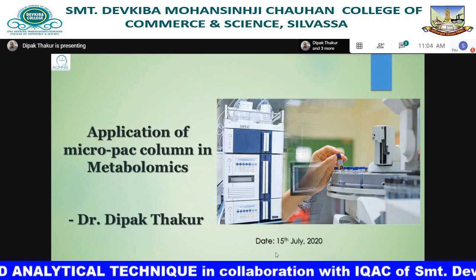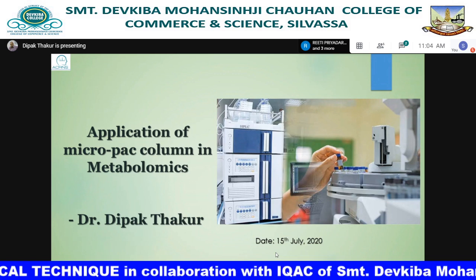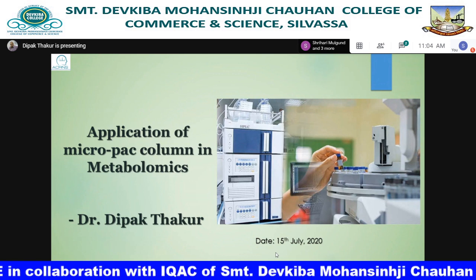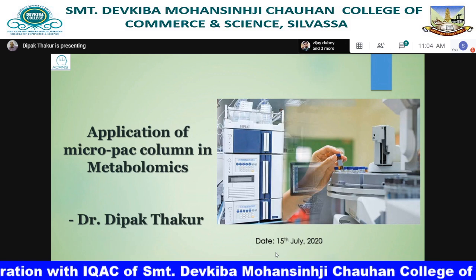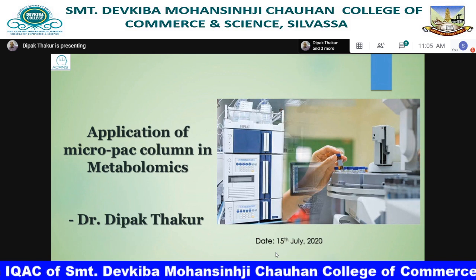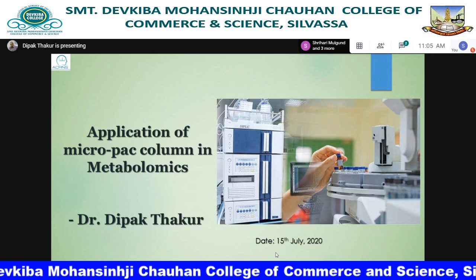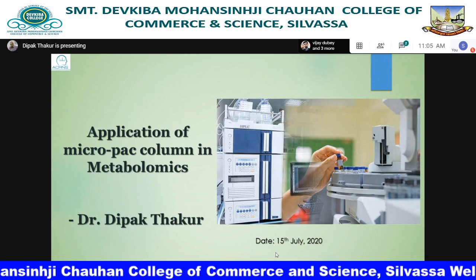Currently, in pharmaceutical or biopharmaceutical industry, the columns are used at a flow rate of hundreds of microliters to milliliter, and the columns have packing material, that is spherical silica particles ranging in diameter from 1.7 to 5 micron. This is what usually chromatographers in industry are using.